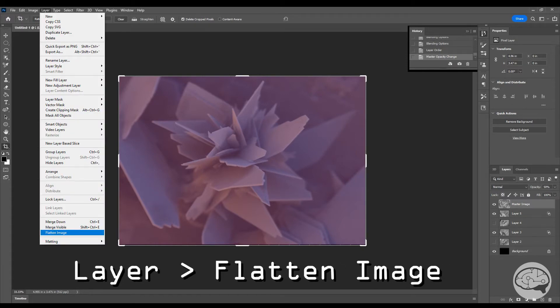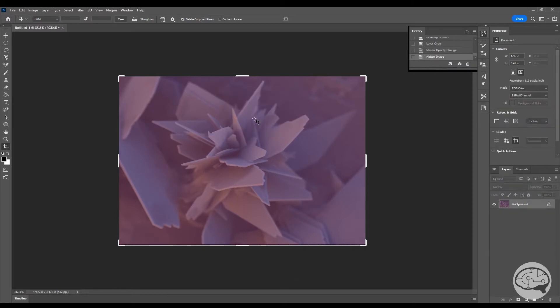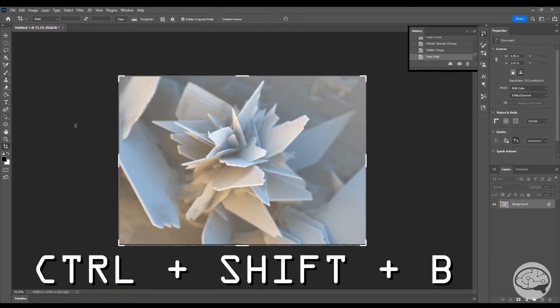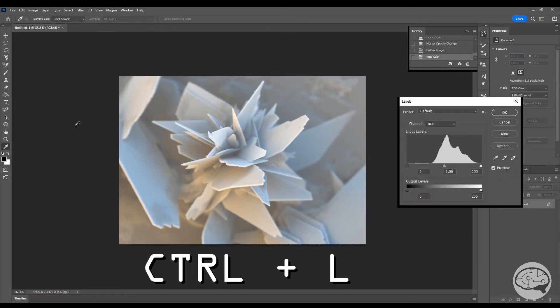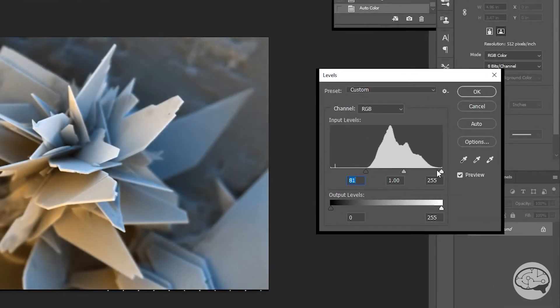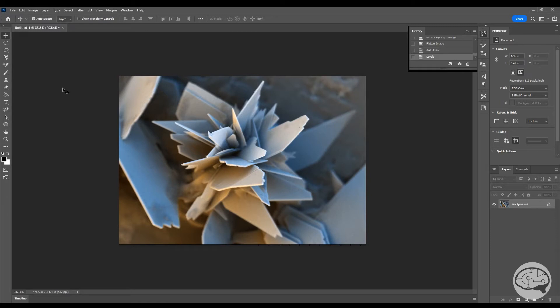The next step is to flatten all the layers into one. If we do an auto color adjustment by hitting Ctrl Shift B, our original colors should reappear. We can also adjust the levels now. We can maybe tweak these a little later if we need to. Again, we could leave the image here, but I think we can keep going a little bit more.